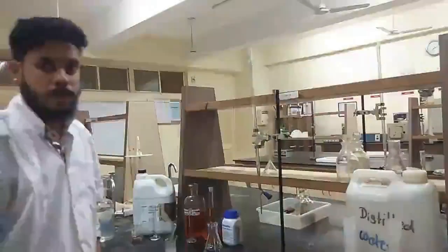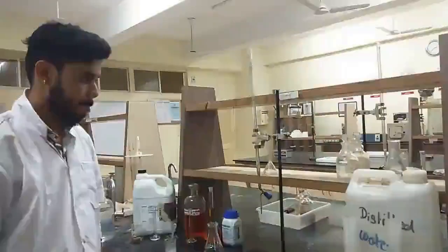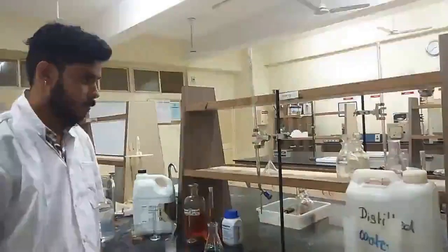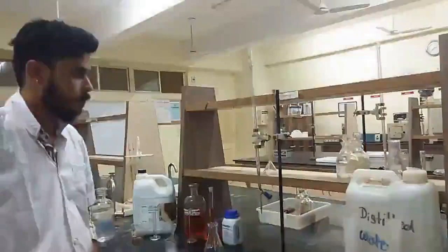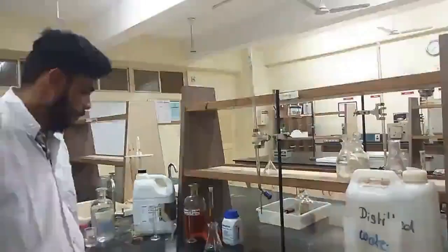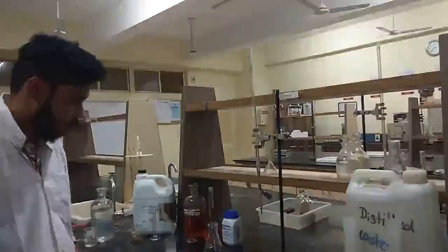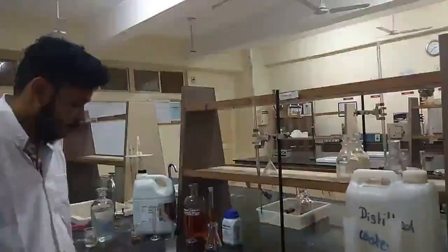Now we are going to find out the normality by using the formula N1V1 = N2V2. Here N1 and V1 will be the normality of the potassium dichromate and the volume of potassium dichromate respectively, which are 0.025 normal and 10 ml respectively.